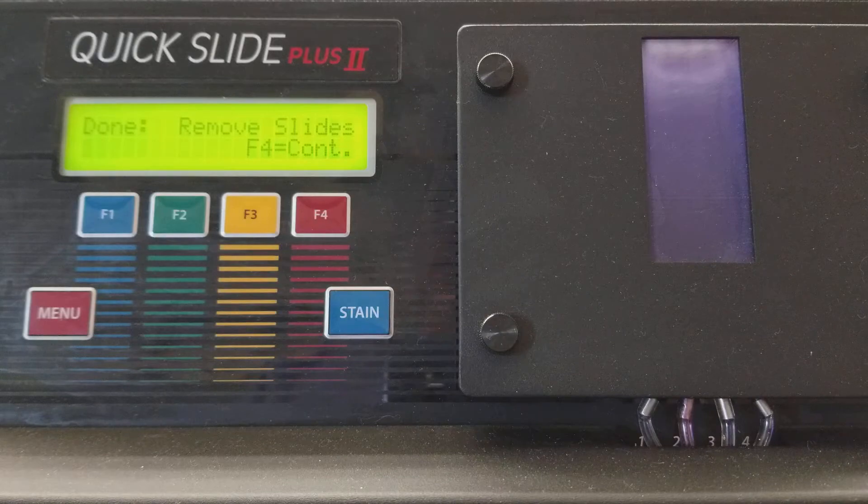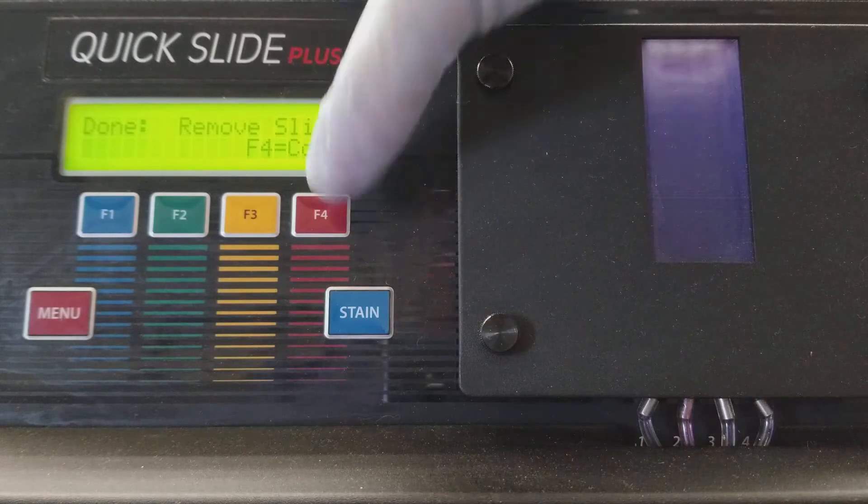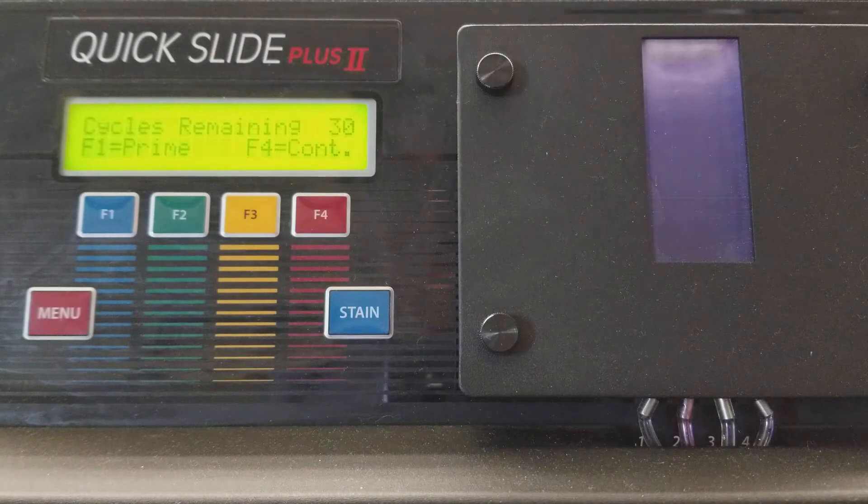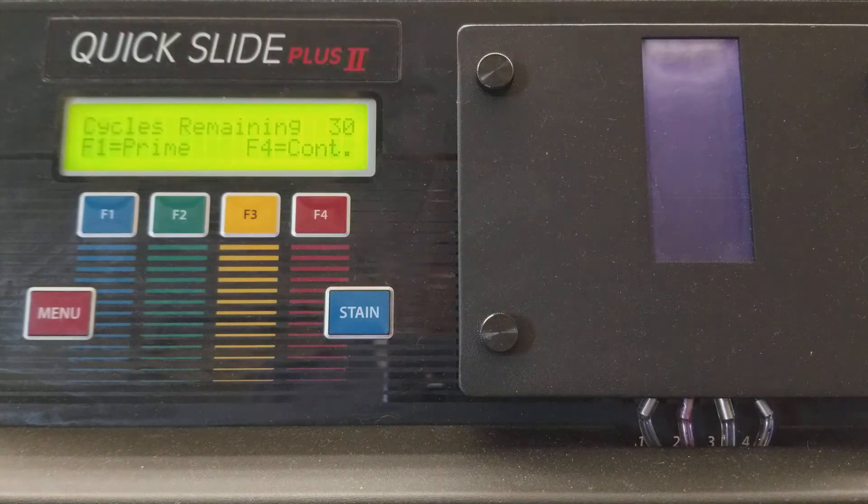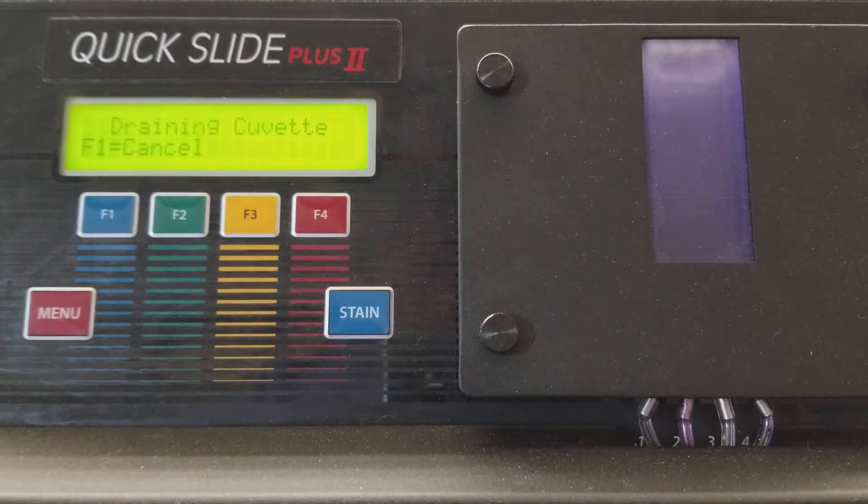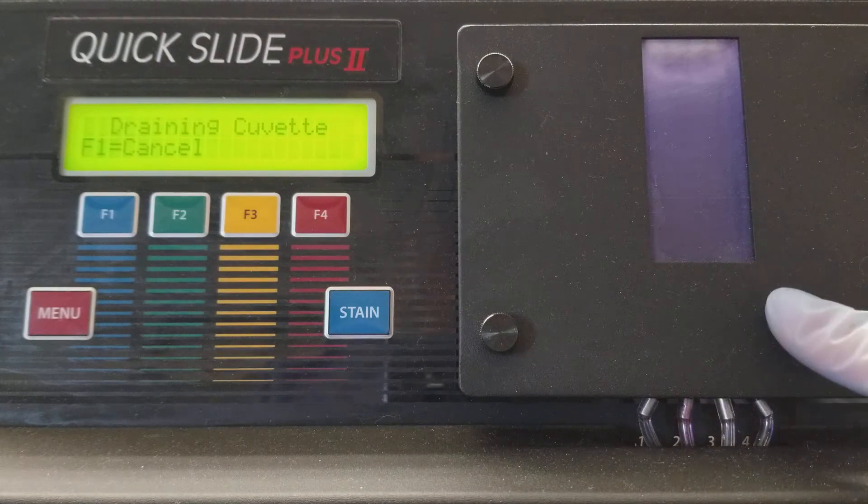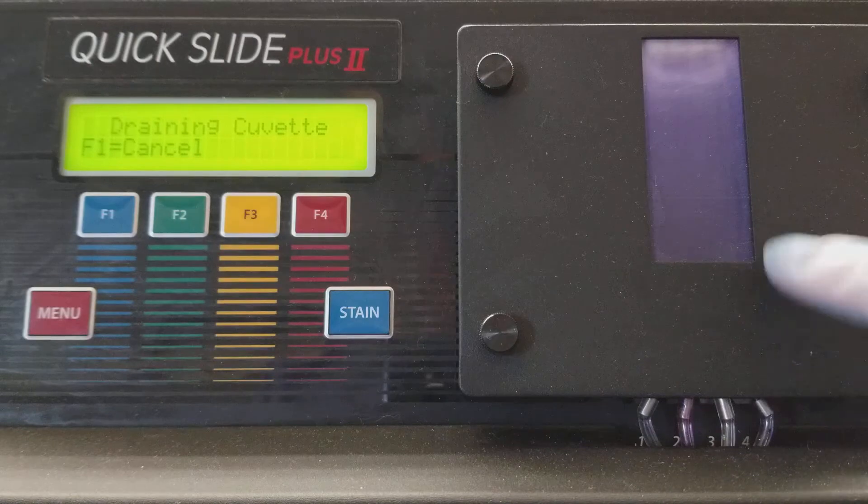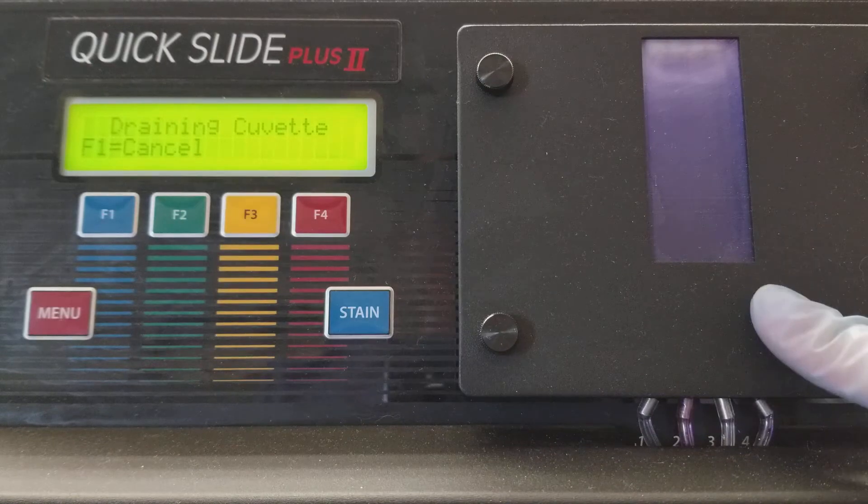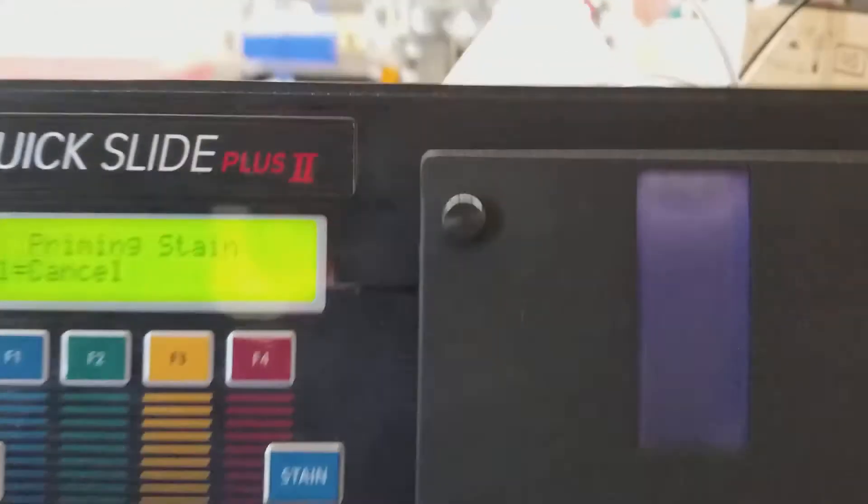Since it's been sitting for a while, we're going to prime it first. So we press F4 to continue and then F1 to prime. So it drains out everything that it possibly has in the cuvette first and it's also then going to prime the line.